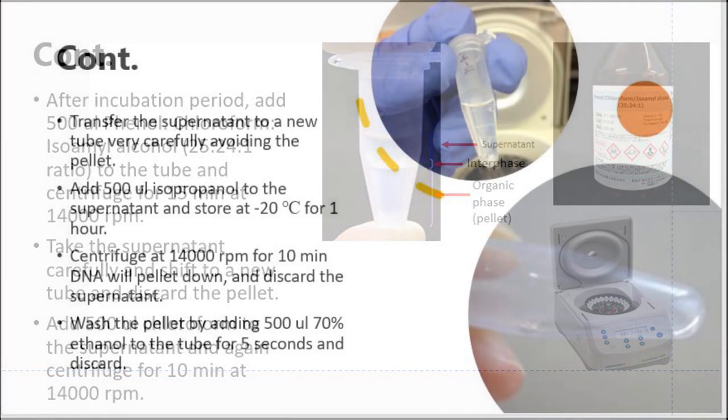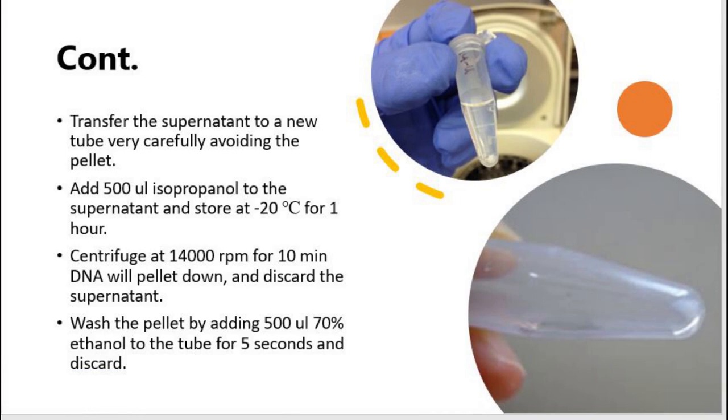Again pick the supernatant very carefully to a new tube and discard the pellet. Add 500 microliter isopropanol to the tube containing supernatant and store it at minus 20 degree Celsius for one hour.